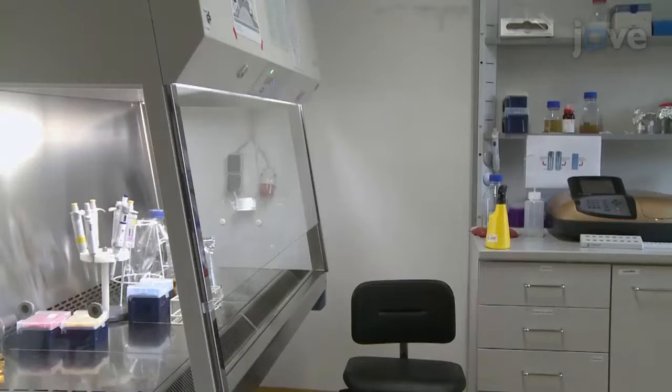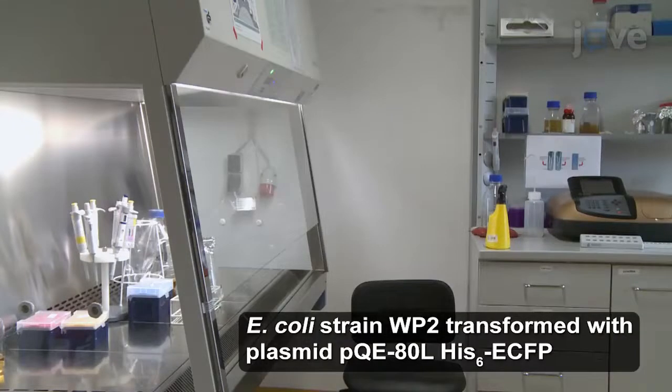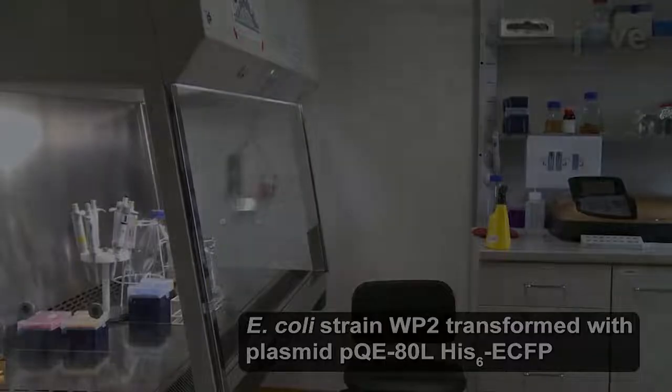To begin this procedure, transform tryptophan auxotrophic E. coli cells with the expression plasmid for eCFP.